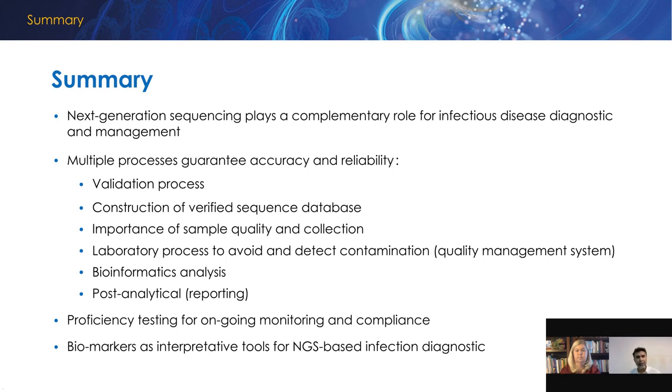There is public database, but again, that database needs to be taken very carefully because it's open. Technically, everyone can upload sequences to this database that can be used as a template for identification. If we recognize a sequence that is not common in this database, we only have 1, 2, or 3 sequences and they are poor quality, we could be misidentifying organisms.